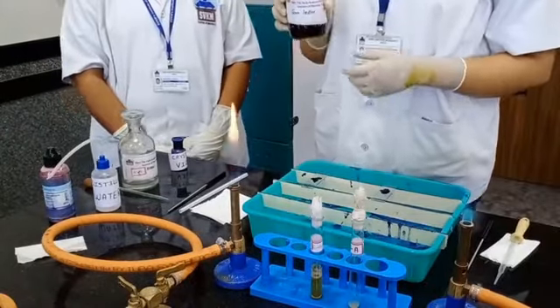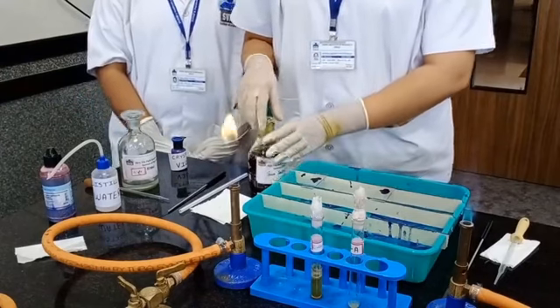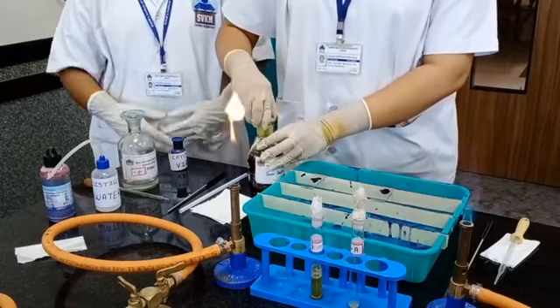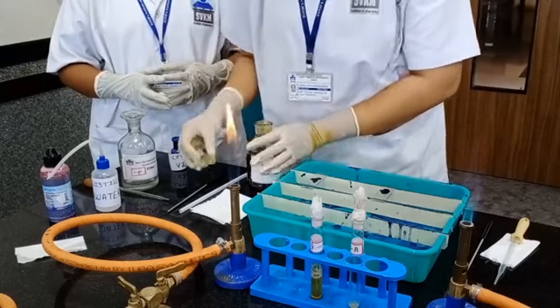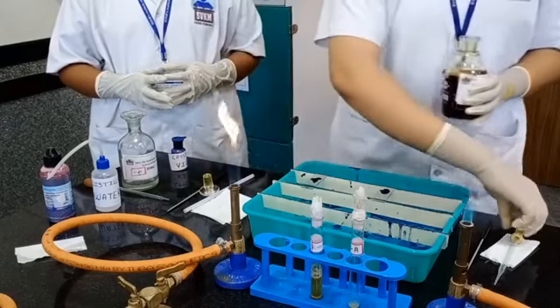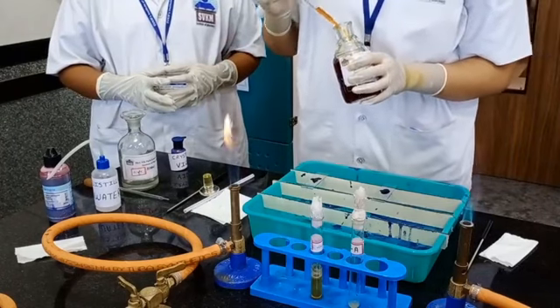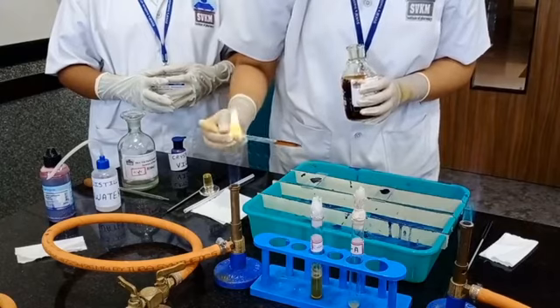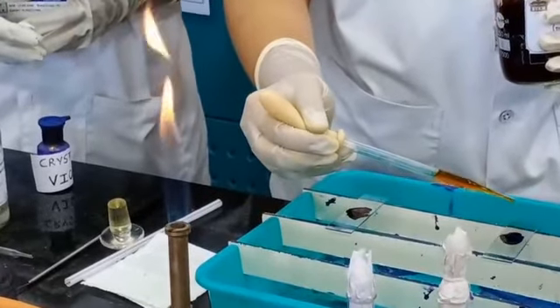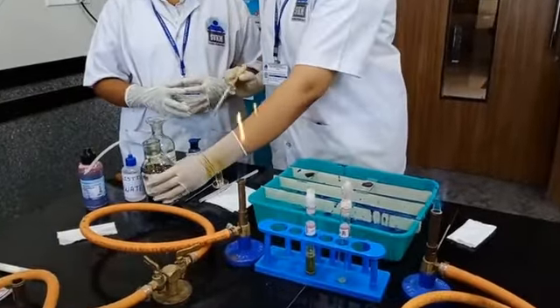Now next is Gram's iodine. It acts as a mordant and it helps to penetrate the cell wall of gram positive bacteria. We are adding 2 drops of Gram's iodine and waiting for 2 minutes.